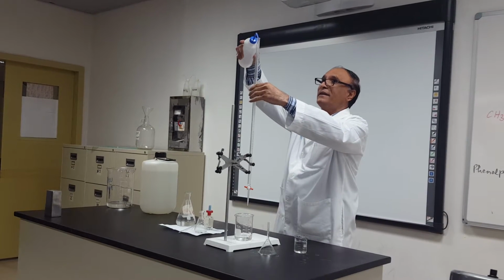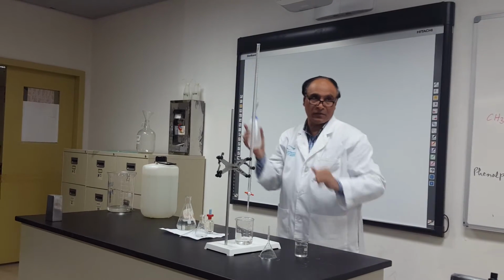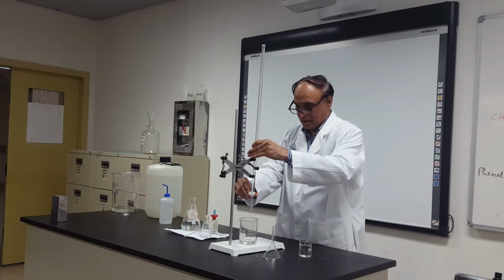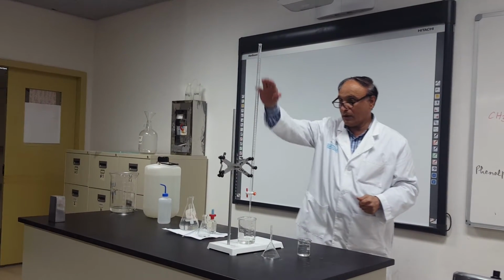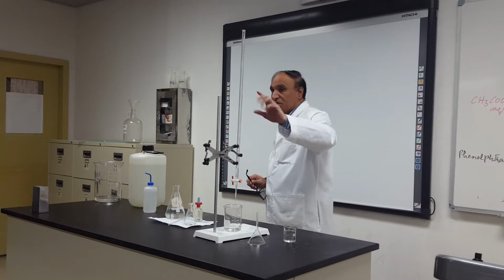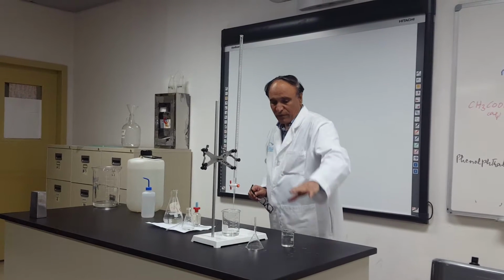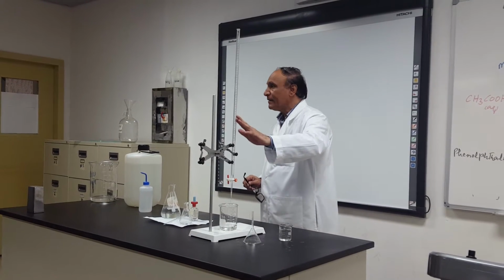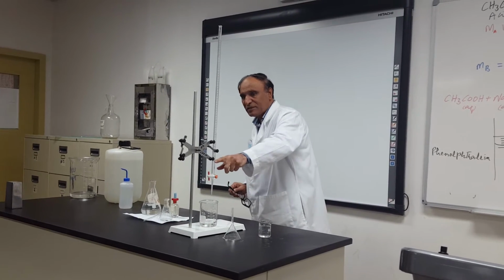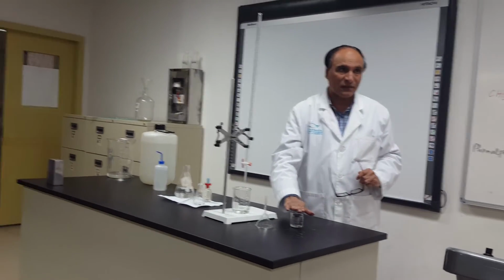Do you see? Yes. Move it. So put some water. Don't put too much. This much amount of water, and open it. So all the water will go down. When all the water is going down, still some drops of water are there. Okay? And if I put the sodium hydroxide over here, it will be diluted. Because although all the water is gone, some drops are still there. So I will wash this burette with this one.